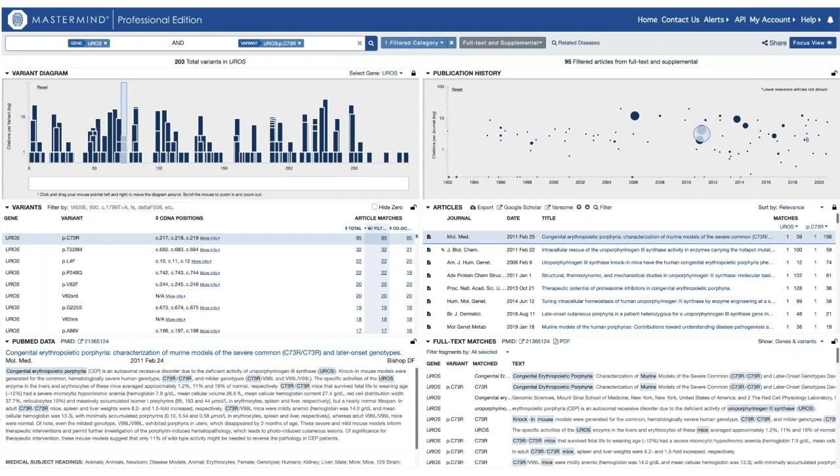And then at the top portion is where users can modify their search by adding diseases, phenotypes, therapies, free text search terms, as well as, in that highlighted blue dropdown in the middle there, any one of those canned categorized key terms such as clinical significance or functional significance, as well as a handful of additional search categories such as prognostic import or diagnostic relevance. So with that, Garrett, I think that's the last slide.